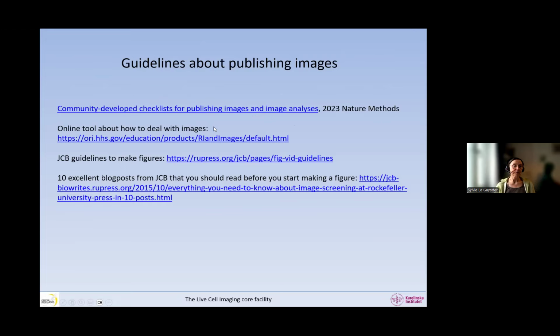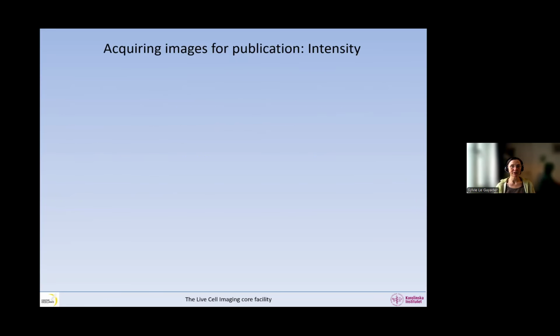So very useful. And then there are a few more here, guidelines from JCB, for example, which is very good at having very clear instructions about what you should do and not do when you publish your images. So, now let's go through my little lecture here.